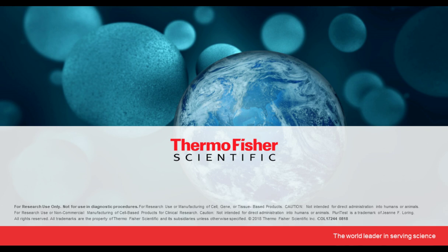That's a great question. We get this question only because of the pluripotency, but as I hope I was able to show you, they're complementary. PluriTest is really great when it comes to standardization, making sure that you're comparable, you have reference sets, and that you're doing comparable work among all the labs in the world, right? So that's really great for making sure you have the pluripotency and having comparability and standardization in the field.